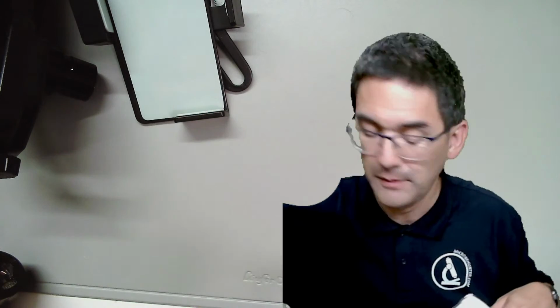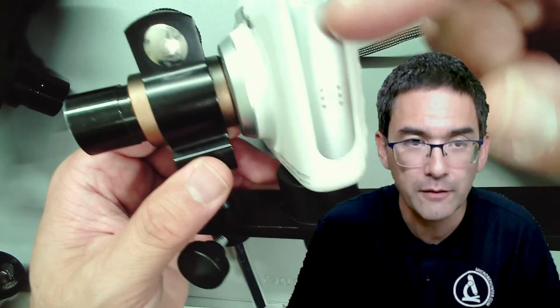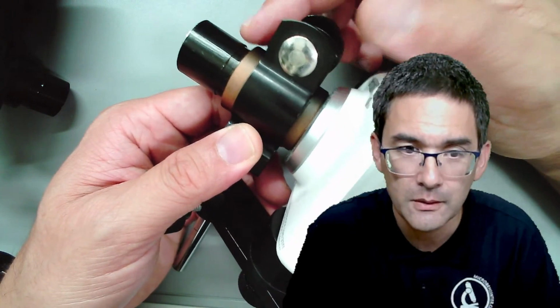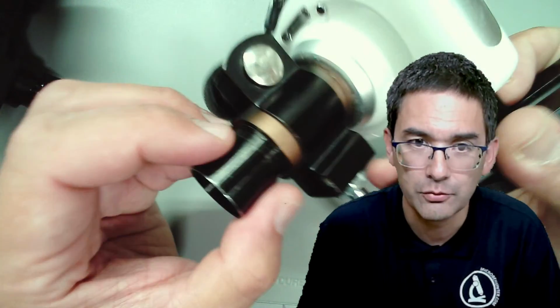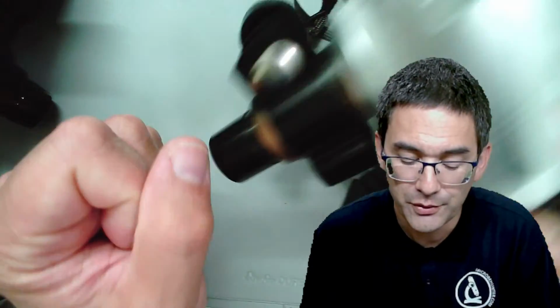There is now another thing that I would like to show you, also afocal photography, which you might not know, and it's an interesting solution as well. There was only one company that actually manufactured this. Look at this contraption here. You have a compact camera. Over in here, I've clamped in an eyepiece. Basically it's afocal photography as well. This goes into the trinocular tube, and the eyepiece is in there, and then you can also take pictures. Very similar to a mobile phone.